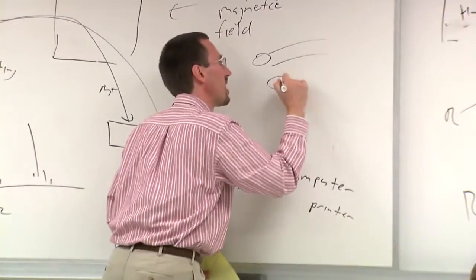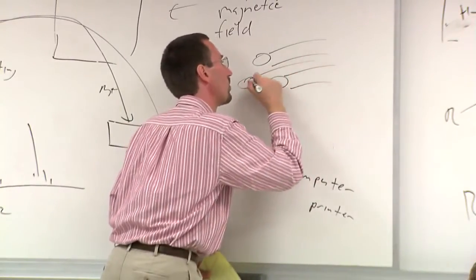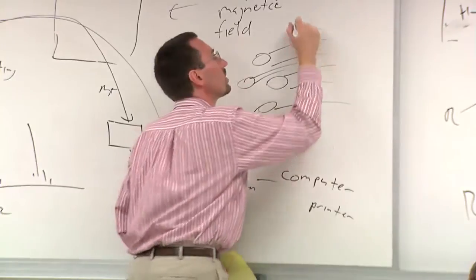So for example, another detector that's used is called a quadrupole detector.